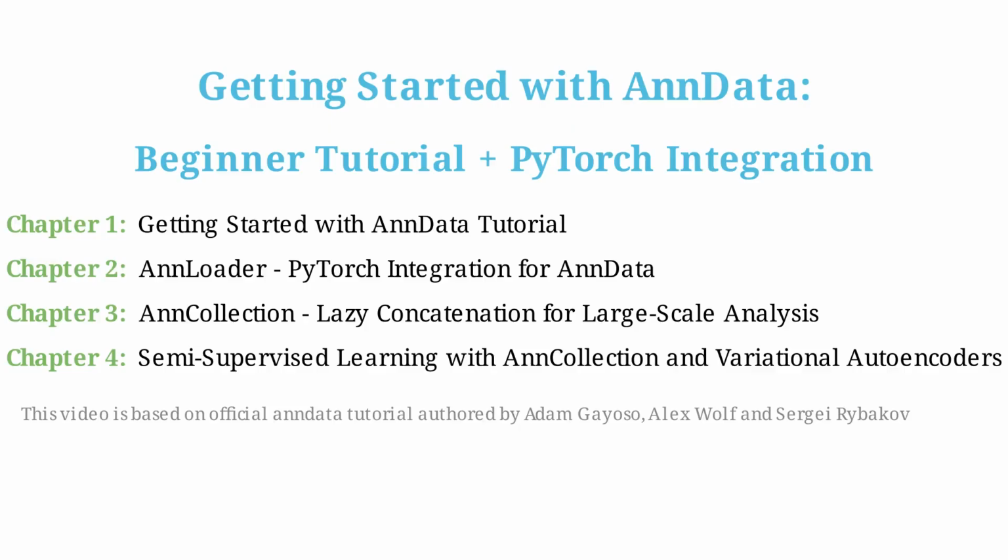Then in Chapter 2, we'll dive into AnnLoader, which provides seamless PyTorch integration for working with Anndata objects. Chapter 3 will introduce us to AnnCollection, a powerful tool for lazy concatenation that's essential for large-scale analysis. Finally, in Chapter 4, we'll explore an advanced application, implementing semi-supervised learning using AnnCollection combined with variational autoencoders. This progression will take you from the basics all the way to cutting-edge applications in biological data analysis.